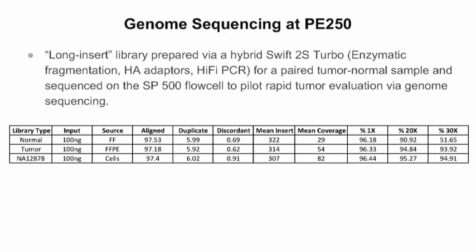And not surprisingly, it's highly dependent on the sample, so it's tough to draw any broad conclusions other than to say this overall scheme can be reasonably effective and empowering if you're willing to pay for intentionally duplicating your read coverage and then design the downstream pipeline to utilize that information rather than throw it out. So it does require some careful modifications to a typical pipeline.